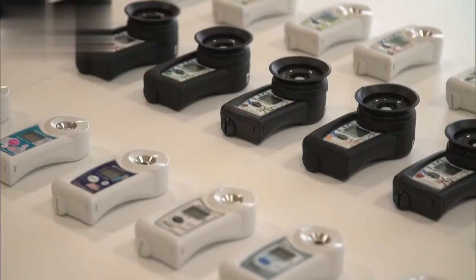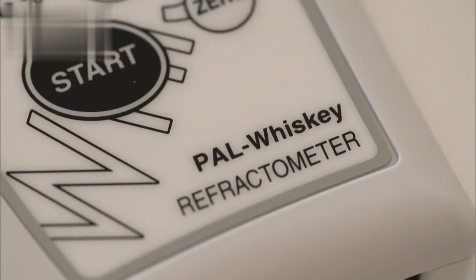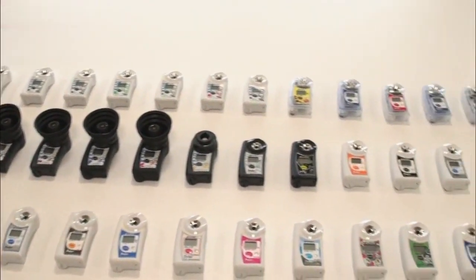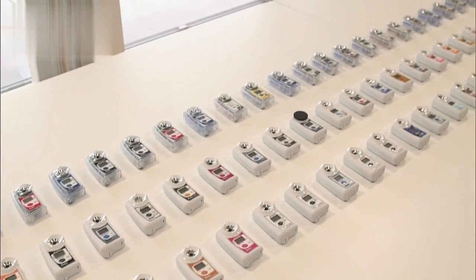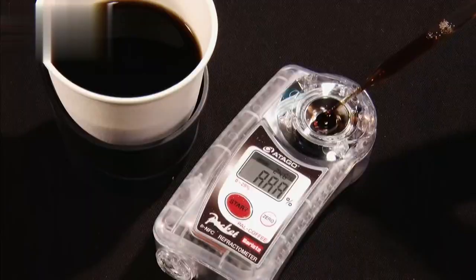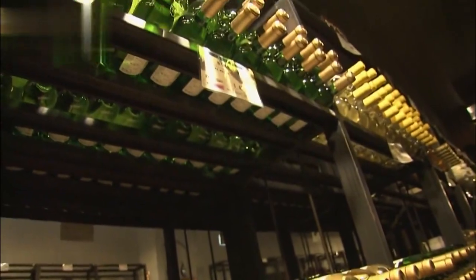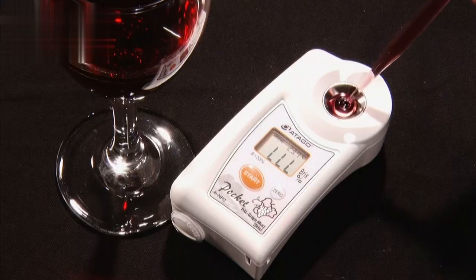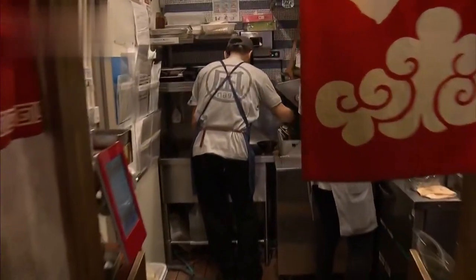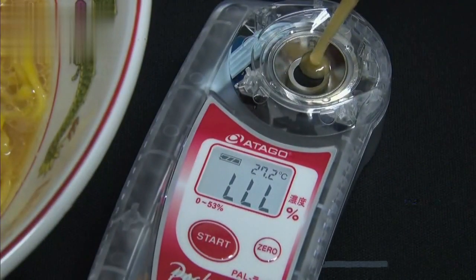Different models which use the same principle have been developed in order to measure the concentration of other foods. There are over 200 different models now. There's one to measure how strong your coffee is. One to measure the alcohol content in wine. And even one to test the concentration of ramen soup.